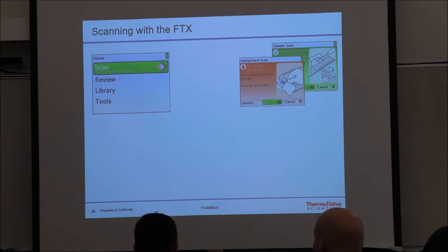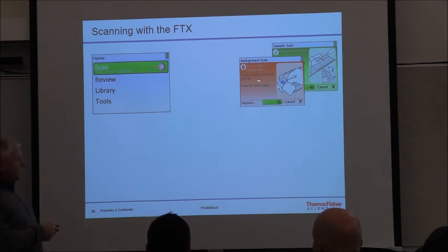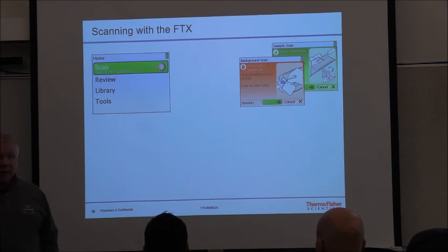So when you get ready to run a scan, and the scan is the same for the RM and the FT. But on the FT, when you get ready to run it, you're gonna get that reddish or orange colored background. It's gonna say, stop. I have to do a couple of things. I have to clean the diamond off. So did you clean it? And in your kit, you should have alcohol wipes. I've got more with me. So you take an alcohol wipe and you clean the diamond off. Give it a couple of seconds to make sure the alcohol evaporates. Run it background.